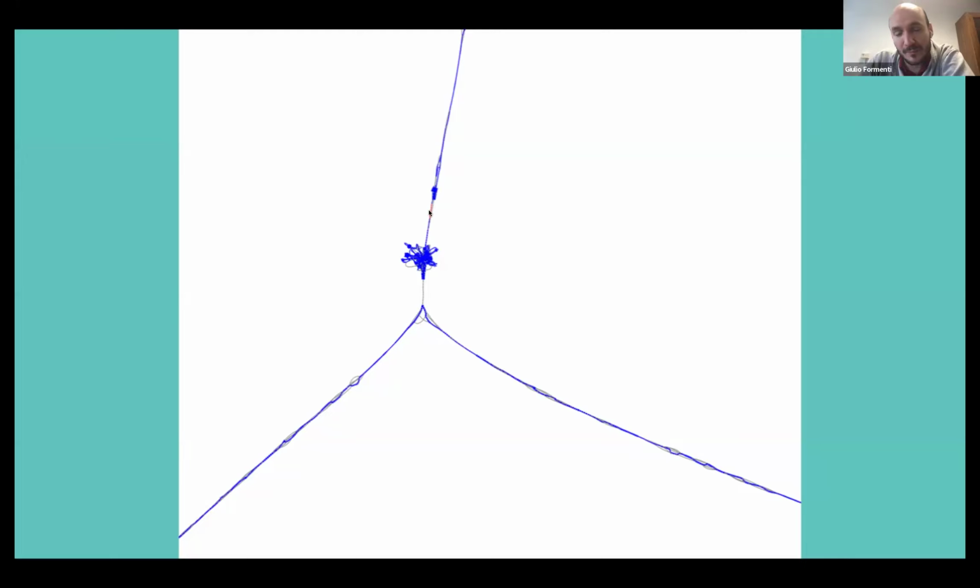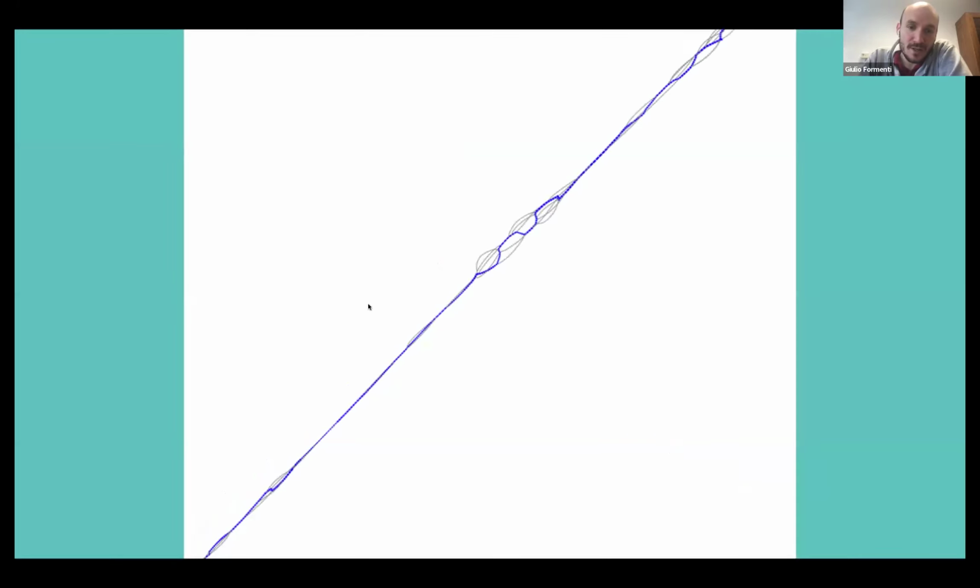So the red points here correspond to k-mers that are never seen in the reads, but are seen in the assembly. And as you can see, there is an alternative path here, which suggests that probably this is the actual real sequence for that particular position. So again, the goal is to even visually, but also programmatically, identify and potentially correct these errors.